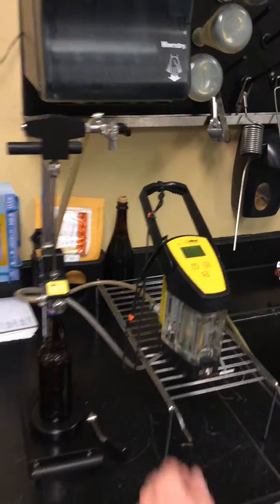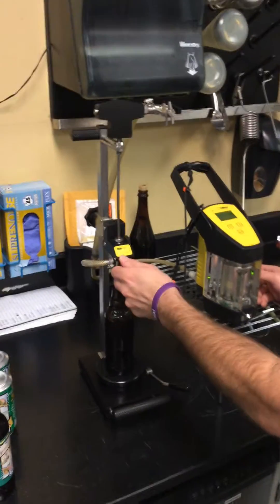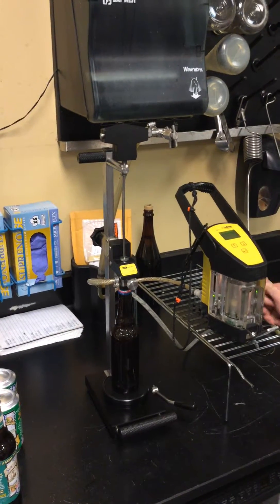So we set it in here, CO2 is correct. Now close your gas valve, top valve, then close your side port.